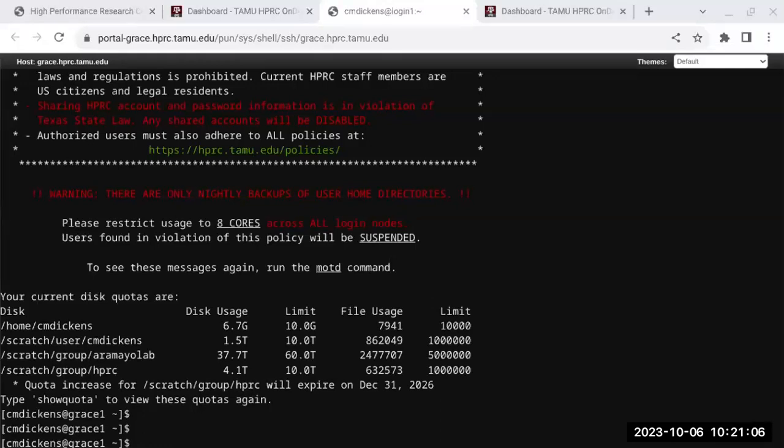And then you have FASTQ format files. Here's the pair. They're maintained in order. The first entry of each of these files is the same DNA fragment. In the past, there's been some software where when trimming is done, the order is not maintained. But a lot of the better software will maintain the order when reads are trimmed.